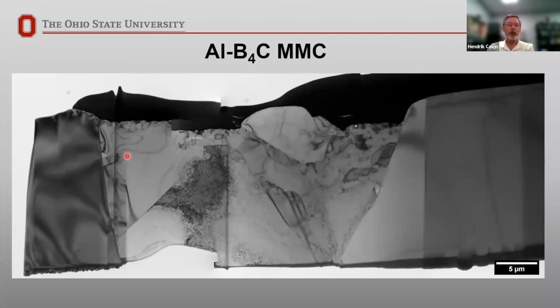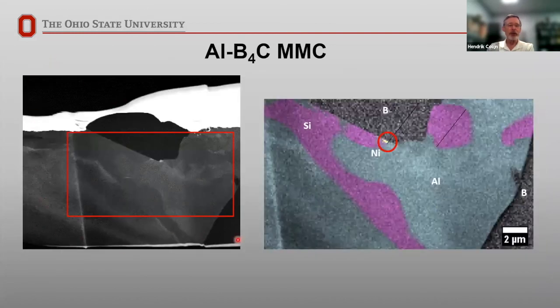phases. So I went into STEM mode and focused on a smaller area of this sample, this area, which is now shown in this image. And then from this image, I collected a spectrum image from this rectangle here. As we look at it, we see that I've got silicon and aluminum and my boron carbide up here. Now, this is pretty close to what you could do in an SEM. You see that I've got a 2-micron scale bar here.